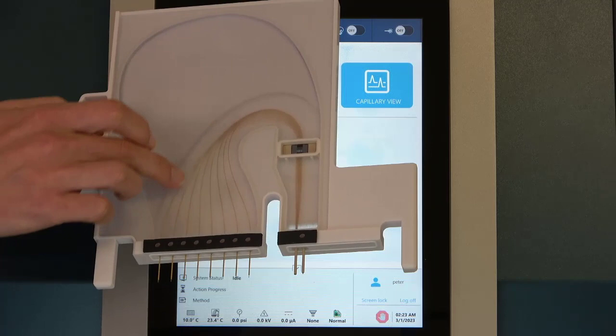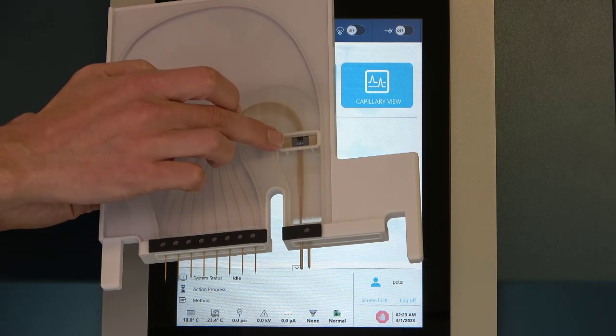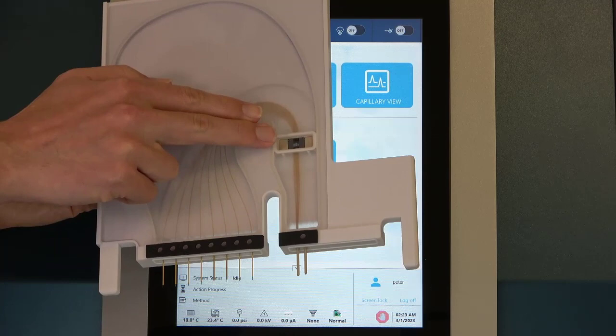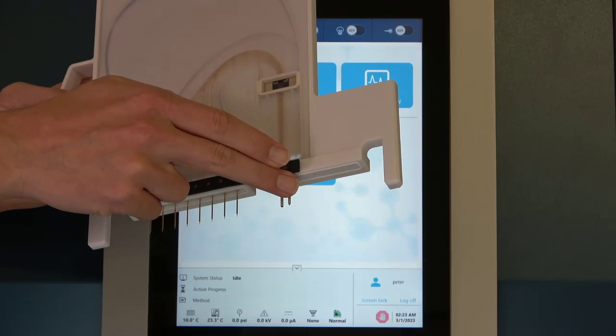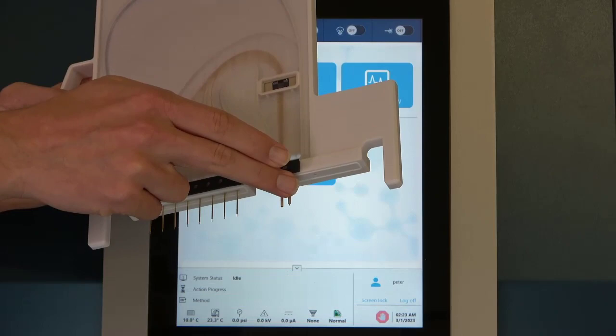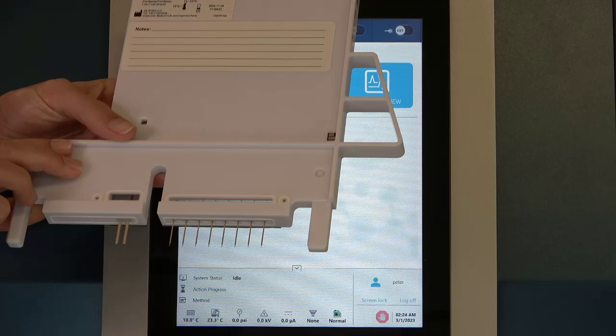All those capillaries come up and over the top, and there's a partition where the coolant flows around those capillaries to keep our temperature controlled. All eight of those capillaries thread around to our detection window. You'll also notice there are no more apertures, so there's really nothing you need to do whether you're using UV or LIF analysis — it's just our detection window. Then all eight capillaries go down to the outlet side where they're bundled together, sharing one common electrode.